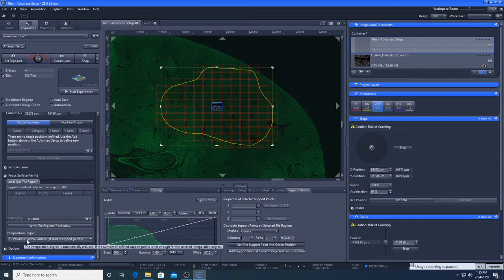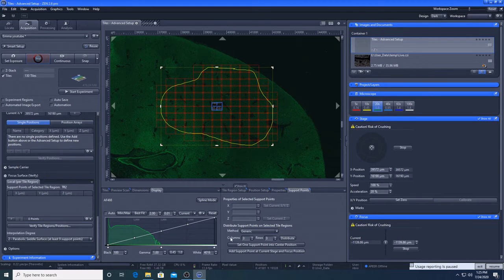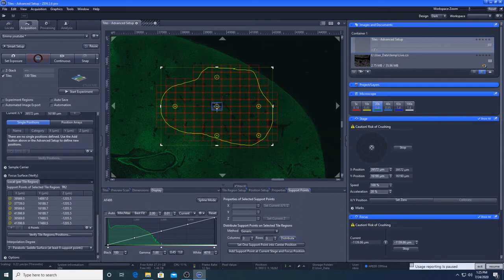I've just got this area here where the support points will go. So I want to make sure that it's parabolic saddle, at least nine support points. And then I'm going to use this bit 3x3 and I'm going to distribute those. So because it's not an exact square, it's not put on nine. So we're going to add on some extra ones.